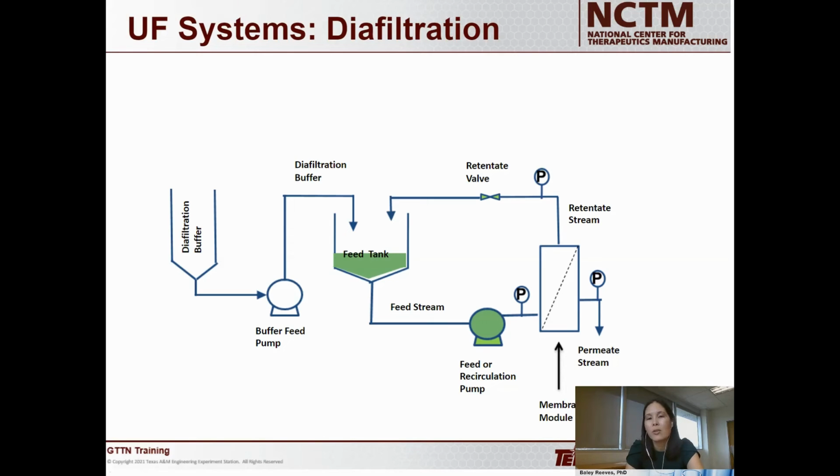The concentration of your AAV and the volume in your feed tank are remaining the same, but the composition of what that AAV is dissolved in is what is changing over time. And that's going to allow you to formulate your product into whatever solution you need for patient administration or long-term storage.